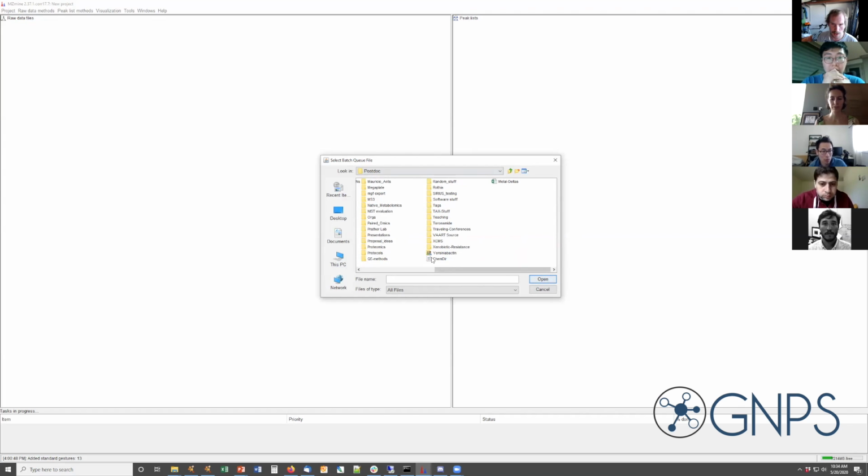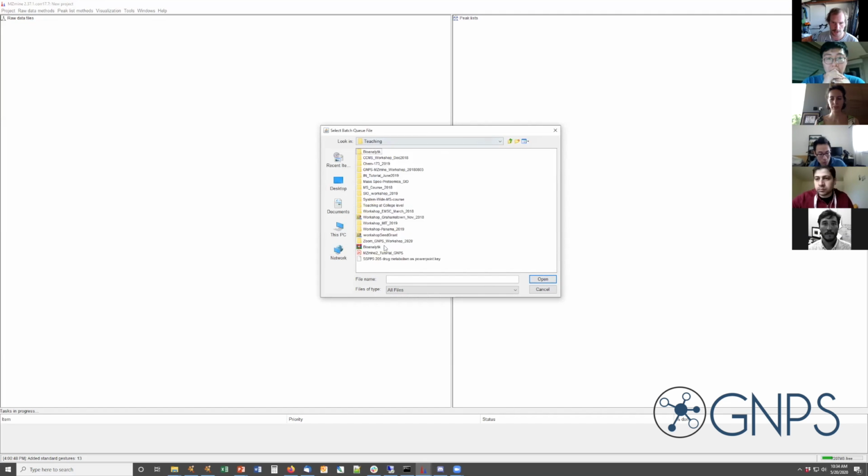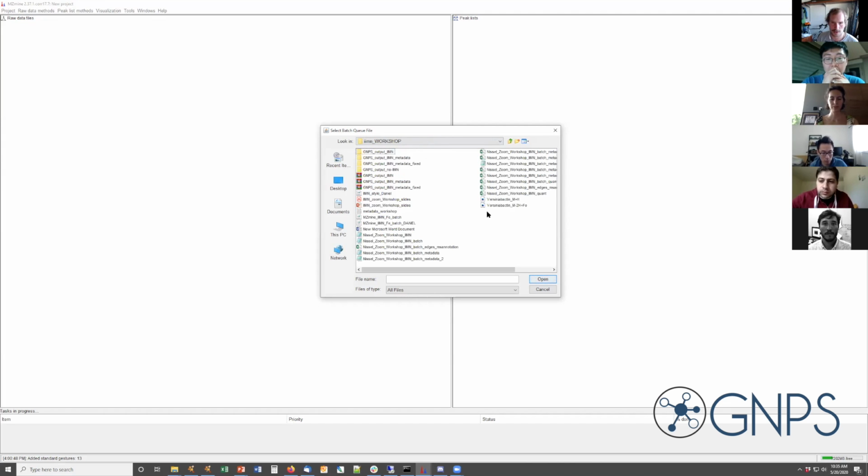But that's the same version. I think roughly it should be the same. We simplified some of the settings, so some options were removed, which I'm not 100% sure is the same as in the videos which are online. But I think roughly the settings are more or less the same. And if you hover over the fields, there's a short description, and there's also documentation to do that.